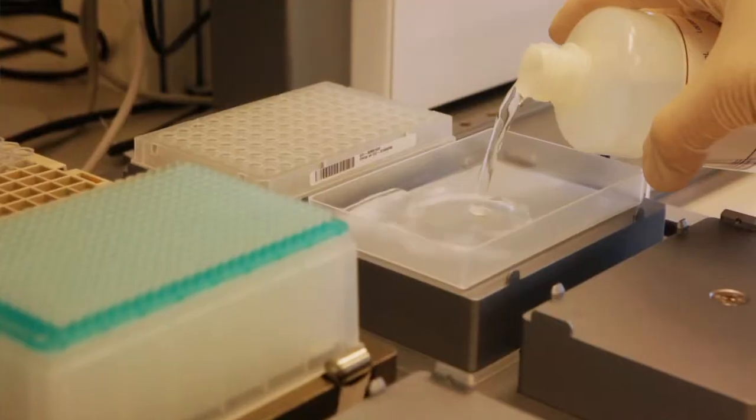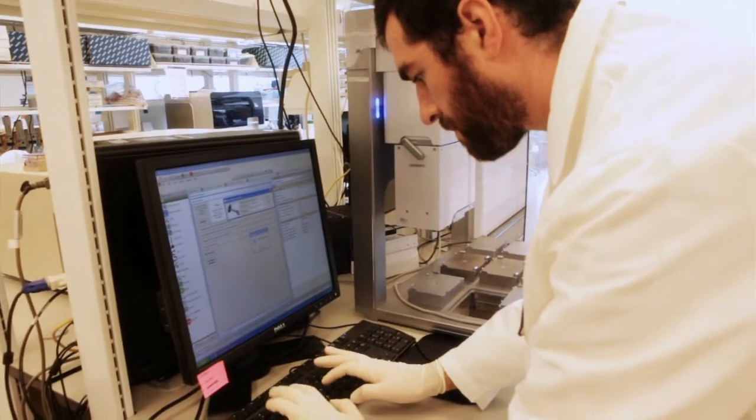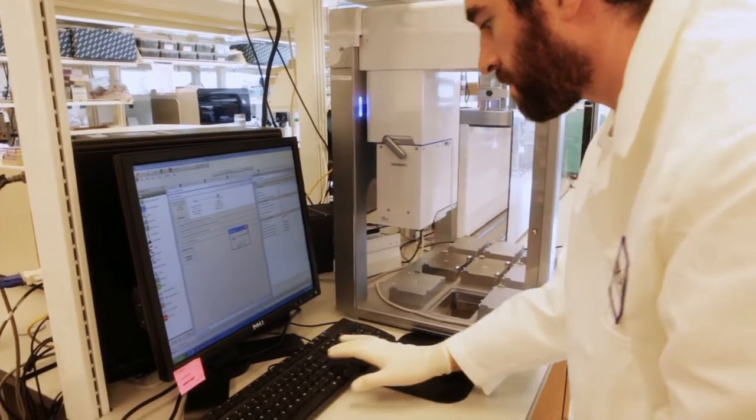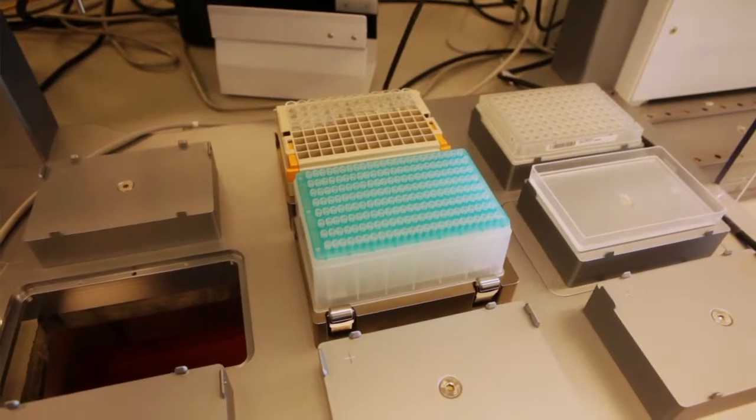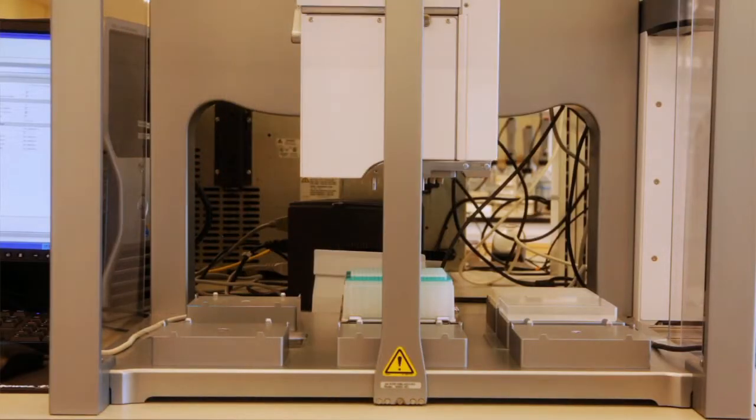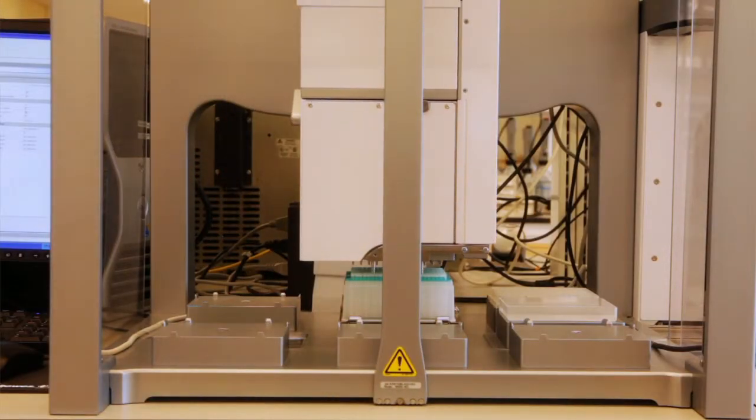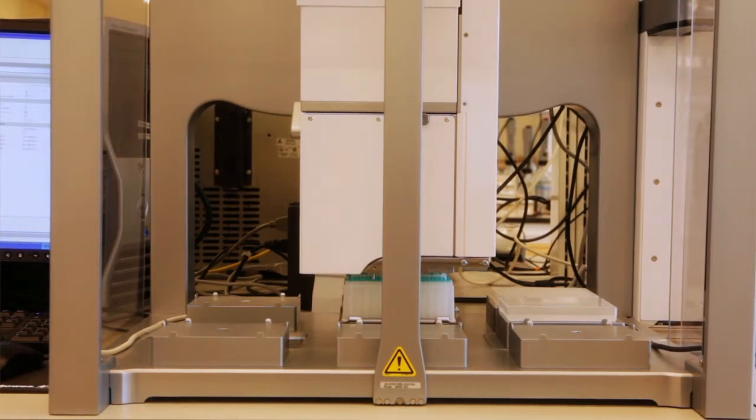The reason we have to normalize the samples is because many of our processes require pipetting a minimum of one microliter. And at very high concentrations, one microliter would use up a lot of DNA. So we have to have the samples diluted to a certain amount so that we can continue to do downstream processes without exhausting the sample's volume.